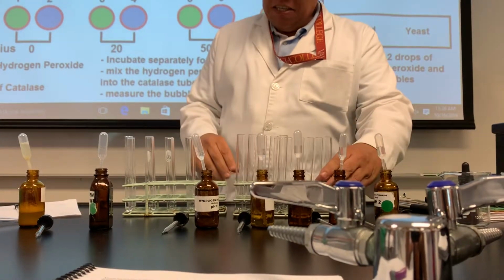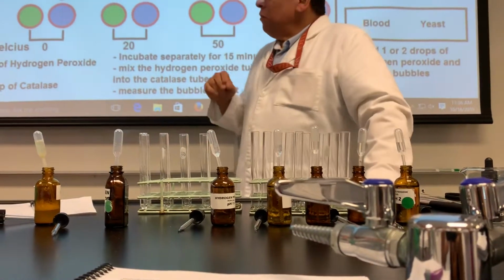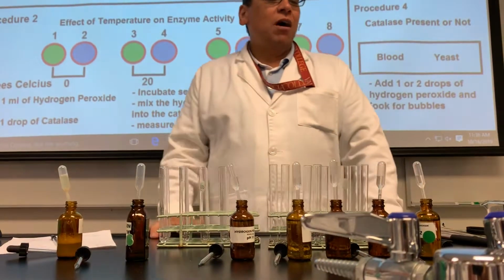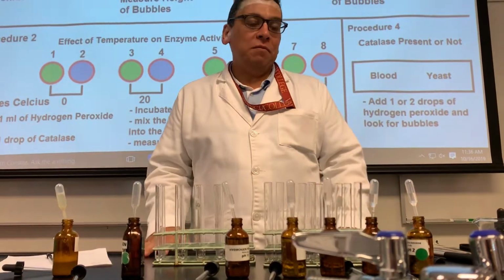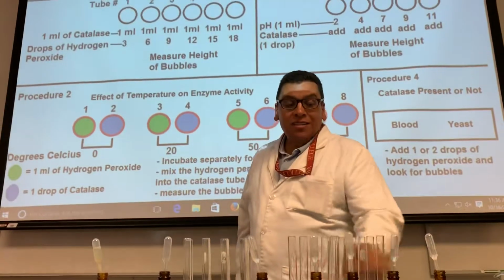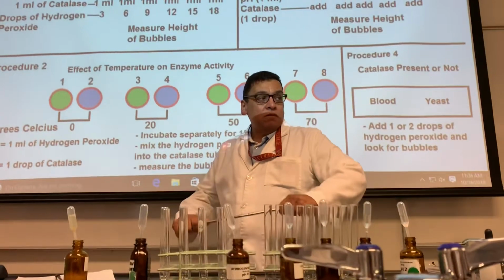All right, let's get started here, you guys. Listen, what we're about to do now is look at all the different things that can affect enzyme activity. So one of the things that we're doing is something called substrate concentration.